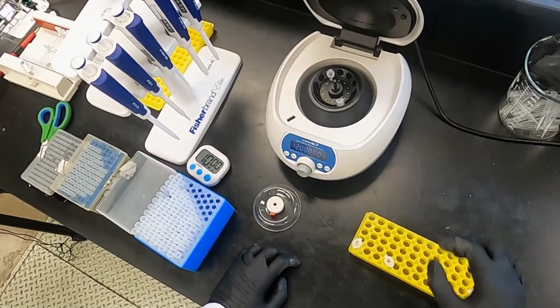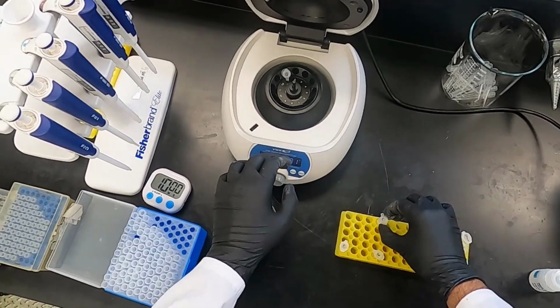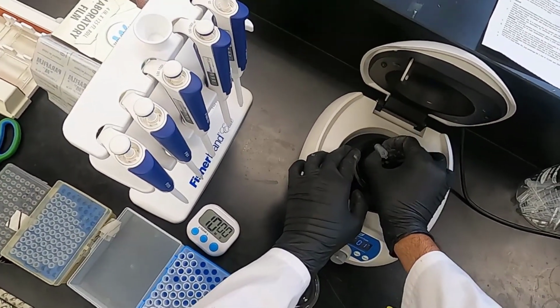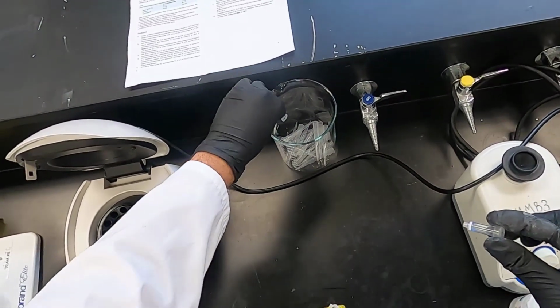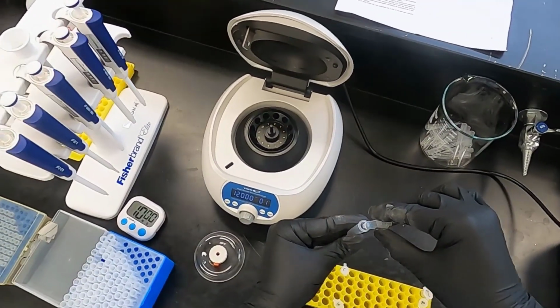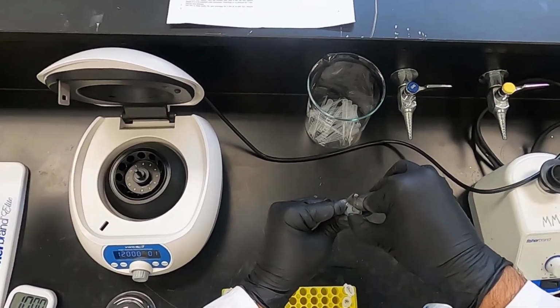Now that we're done with this, we're going to collect our spin tubes. Again, discarding the flow through as that's not what we're after here. So we're just going to discard the flow through. And we're going to do the second wash. This time we're going to be using a different buffer to wash. We're going to be using the PE buffer.